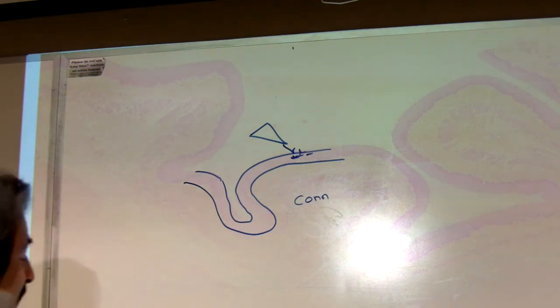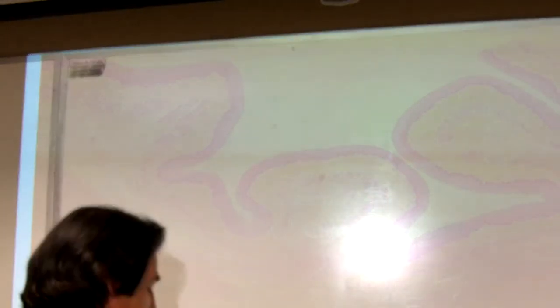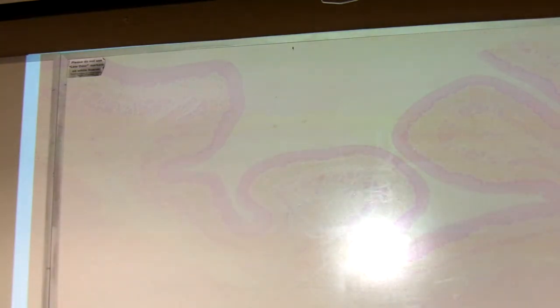So, stratified squamous epithelium. Where do you find that? You find that in your good old esophagus.